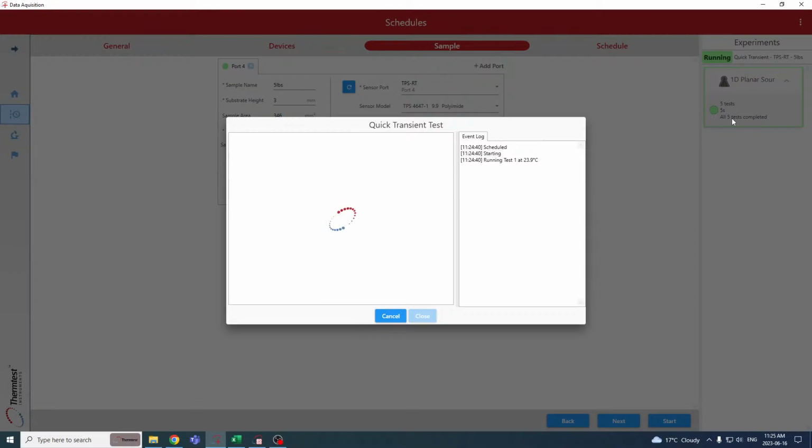I do get the question, why don't you insulate the material? These materials are conductive enough that heat takes its simplest path, and actually air can be an okay insulator. In this case, because these are metallic, that is the case. As you decrease the conductivity lower and lower, you might benefit from some passive guarding, some insulation around those rod-shaped materials. But with these more conductive materials, it's not necessary.